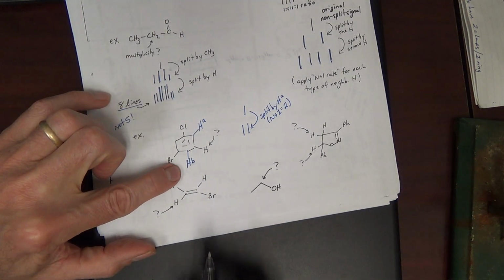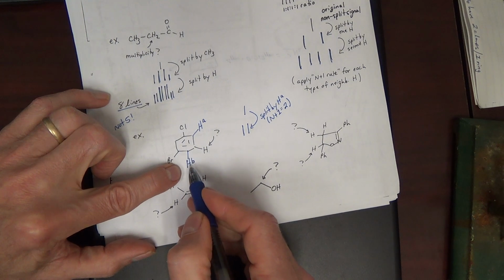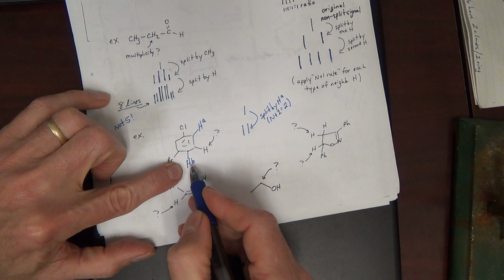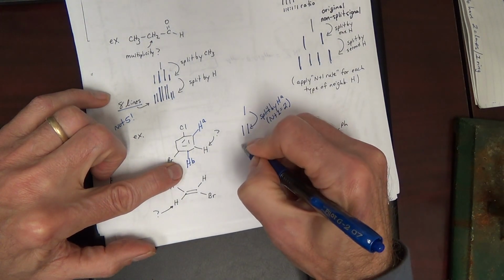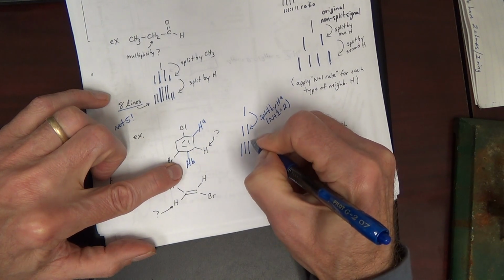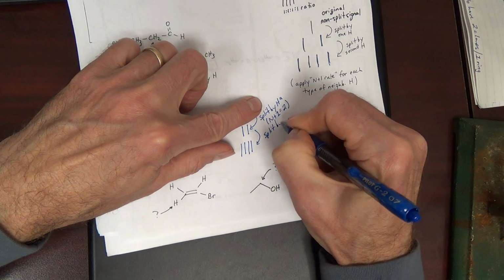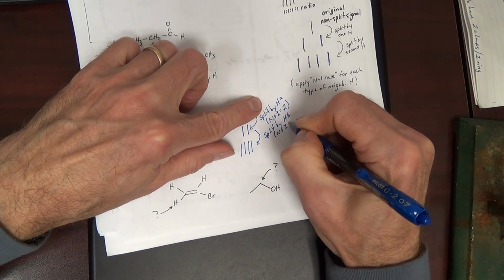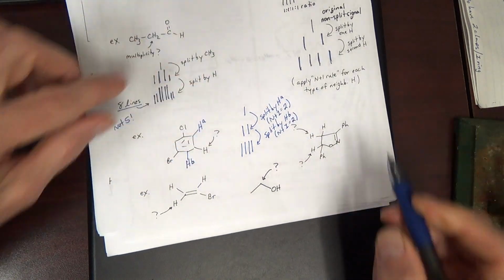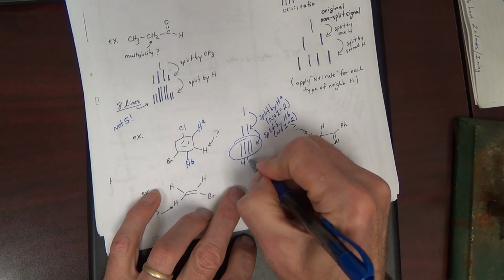Now we come back and split each of these lines by HB. There's only one of these, and that's going to split each of these lines into a doublet. Boom. So each line becomes a doublet, and the signal is going to be 4 lines.